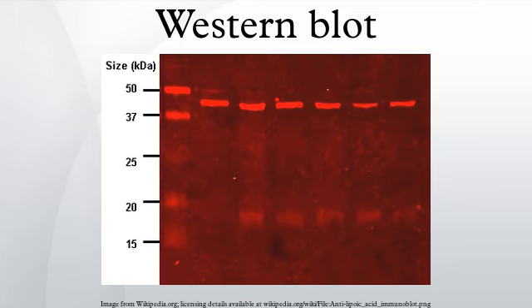Medical diagnostic applications. The confirmatory HIV test employs a Western blot to detect anti-HIV antibody in a human serum sample. Proteins from known HIV-infected cells are separated and blotted on a membrane as above. Then, the serum to be tested is applied in the primary antibody incubation step. Free antibody is washed away, and a secondary anti-human antibody linked to an enzyme signal is added. The stained bands then indicate the proteins to which the patient's serum contains antibody.